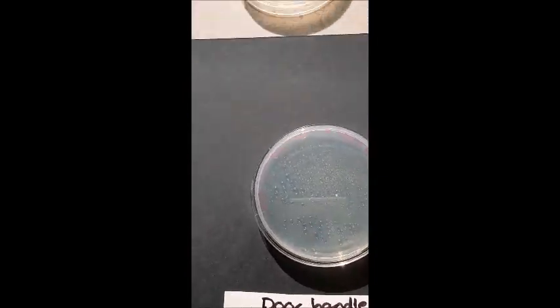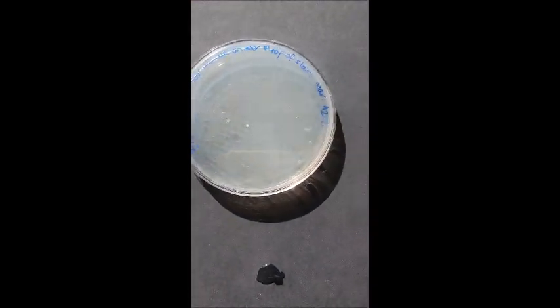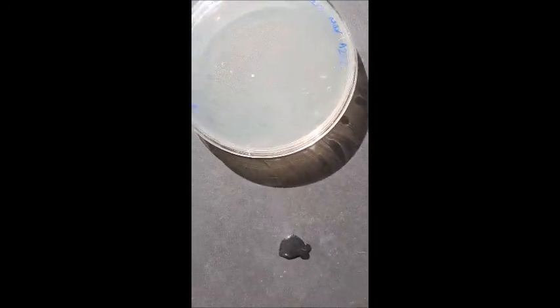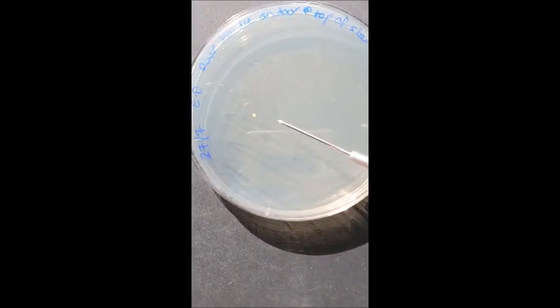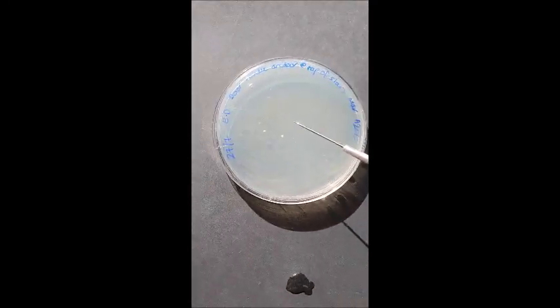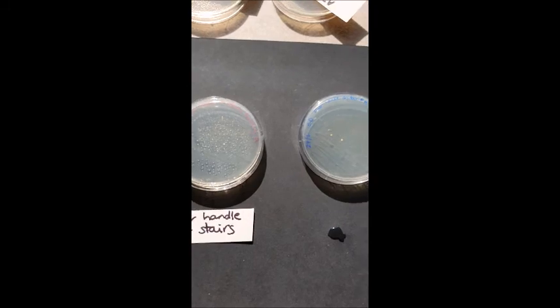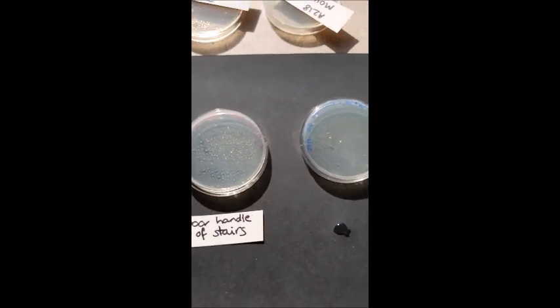Now, I did take another swab of that same door handle for another class. And whoa, it's so different. There's two. So that's comforting. The results are very similar. Two on that one, one on this one. And yeah, they're your results.